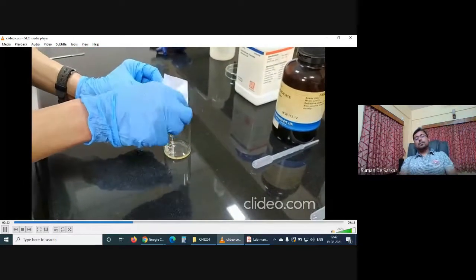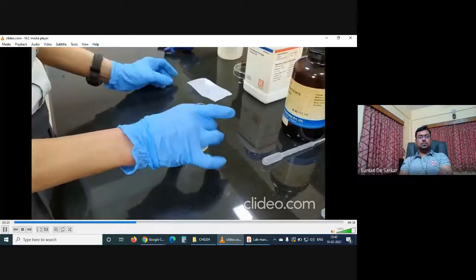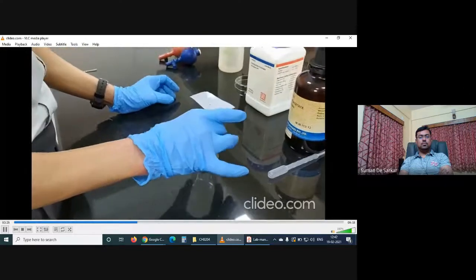Now we'll go for the microwave reaction.